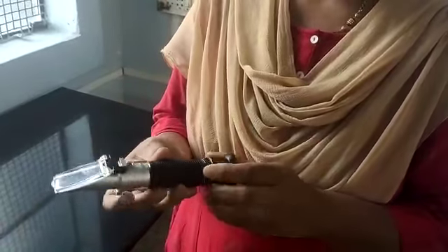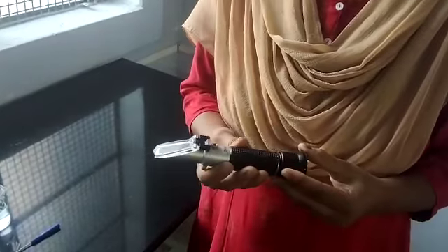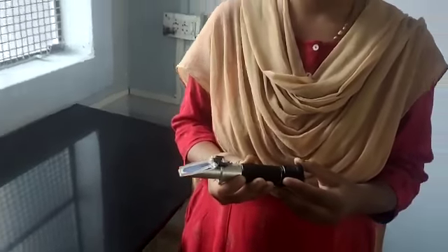To use the hand refractometer with various solutions — the basic application is to detect blood plasma proteins and their concentration, and in human urine to detect the specific gravity of the urine content.